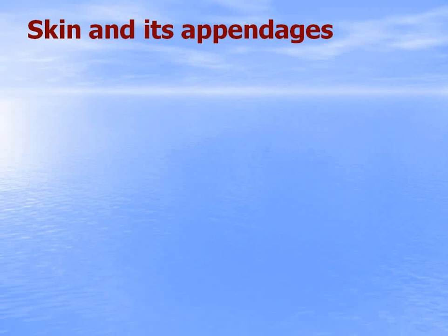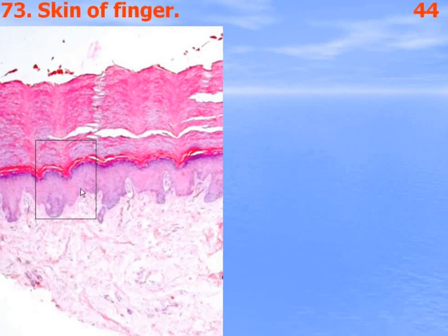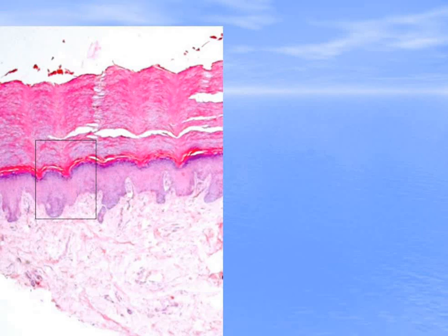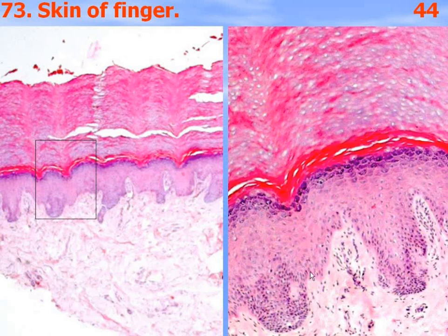Two preparations from the skin and its appendages unit. Epidermis and dermis of thick skin — skin of finger, thick skin. Epidermis is stratified squamous keratinized epithelium. It consists of five layers.